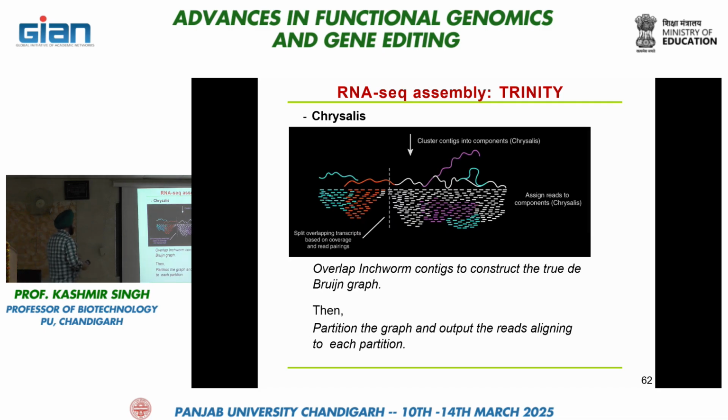So it tries to make clusters of the reads by overlapping them with each other. These are short reads that keep on aligning, and they try to make one long stretch of contigs depending upon the parameters you have set.